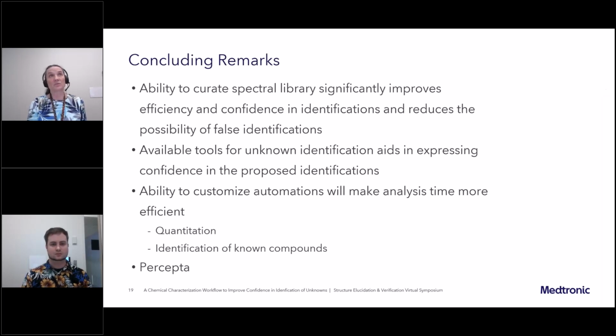I go through the assignments and verify them, and this frees up analysts' time from having to spend long periods of time on those unknown componentized compounds. This is where the custom automation will make this more efficient.